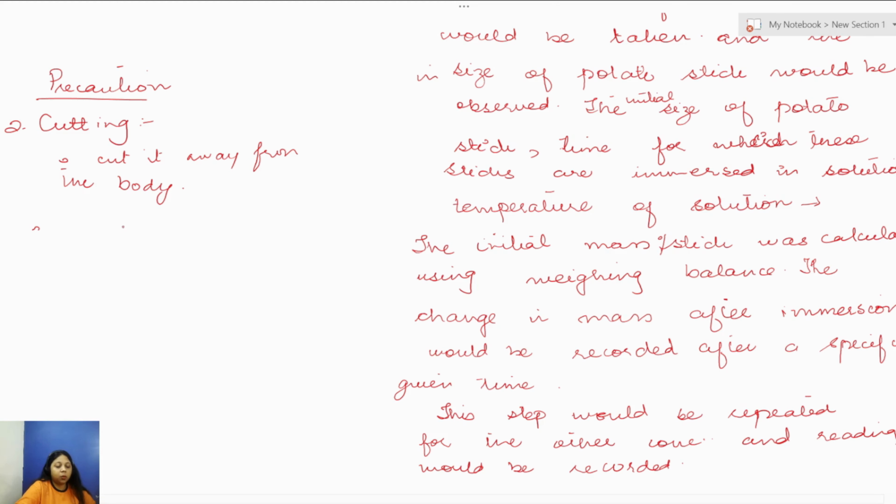If temperature is required, use a water bath. I'm telling you these general ones. If you are checking the effect of temperature, like 100 degrees Celsius or 60 degrees Celsius, the temperature is really high. You cannot touch it directly, so you have to use a water bath, or do not heat directly.